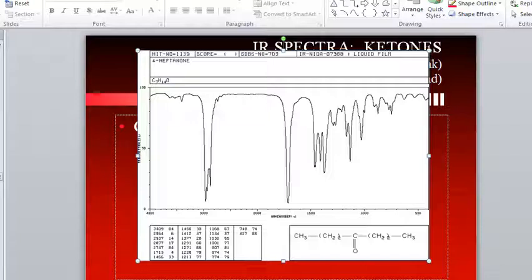Which one of these are important? If I think that that one and that one is pretty dominant, that's 2, and that leads me to believe that it's an ester, which is wrong. It's a ketone. Only one of those is actually important that I should count. So again, put down both, and you get credit.